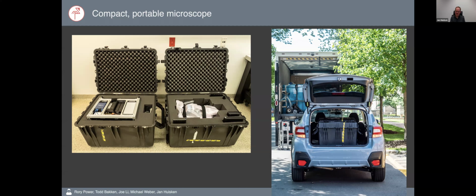Yeah, and as I said, there's no storage and there's no real computer to run the experiment. So people would have to come with at least an SSD. On workshops, we typically bring a 2 terabyte portable SSD, and that's good enough for most experiments. And then we all have a MacBook that runs an app, the Flamingo app, and then we connect to the Wi-Fi on this system.